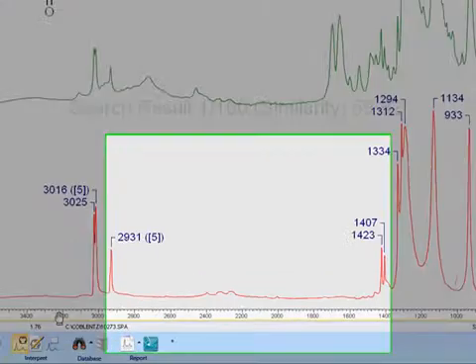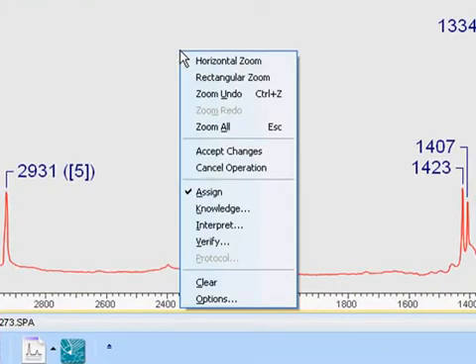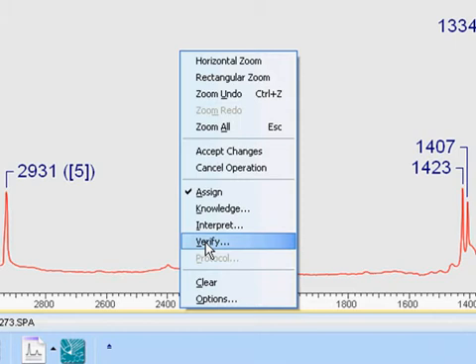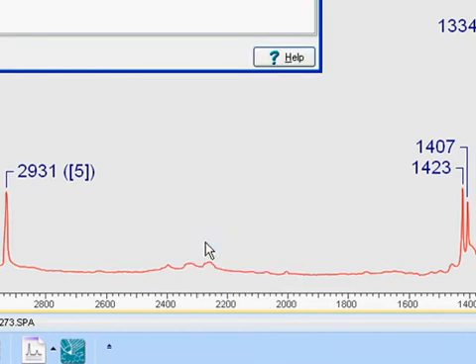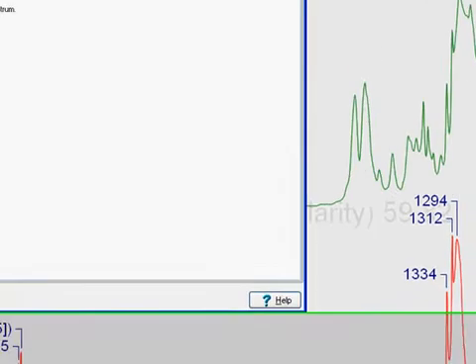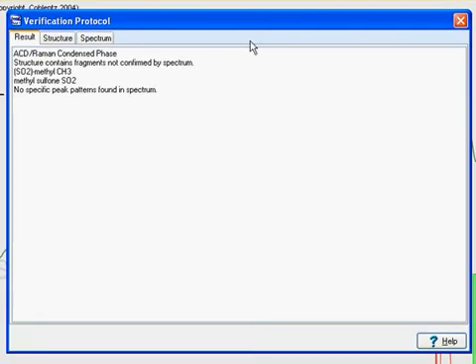Another option is the Verify functionality. This will take the proposed structure, consider its component fragments, and verify whether these fragments exist in the spectrum. In this instance, we are alerted to fragments that are believed to be missing.